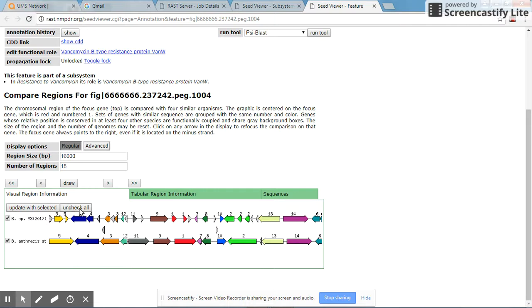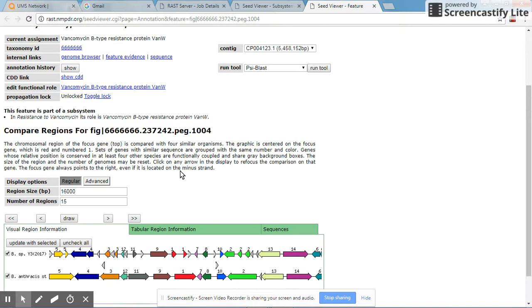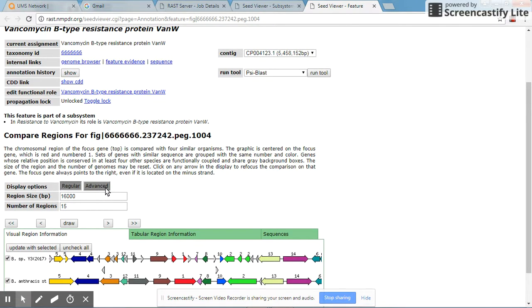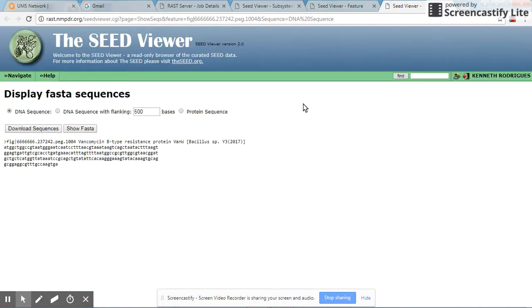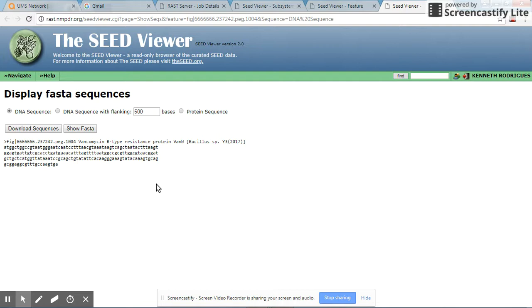In order to view the gene, for instance, if you need to re-sequence the genome or if you are interested in heterologous protein expression of this particular gene, what you need to do is click on the sequence. You will obtain a view of the sequence itself. You can develop PCR primers for this region or develop a synthetic gene construct based on this particular gene and clone and express it in E. coli.